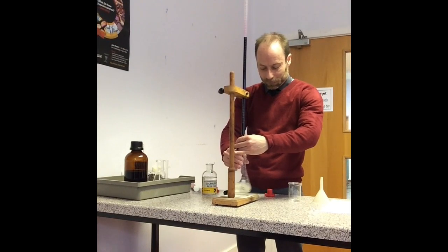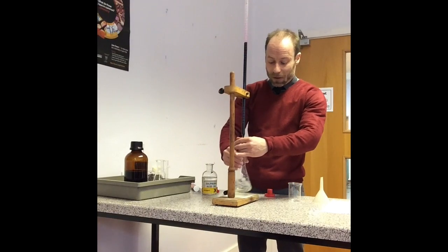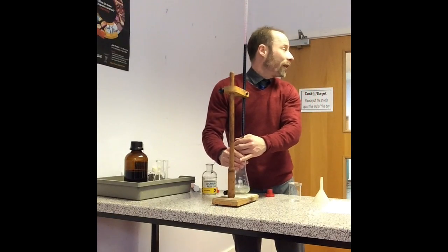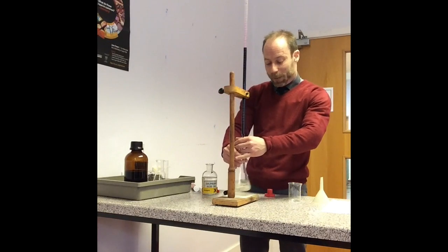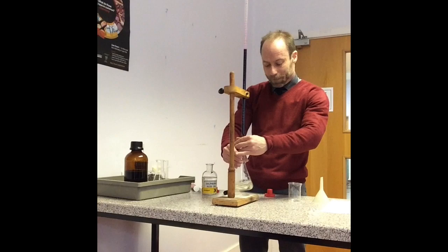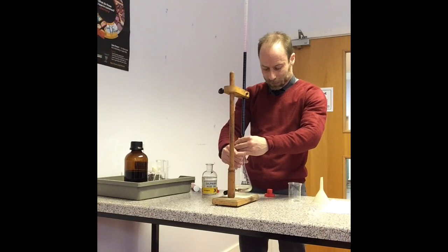I wanted, like, green colour. Yeah. It is originally green because of the iron 2 ions in there. But you basically want the Mn2+ is kind of like a pale pink, but because it's very pale, you don't see it. So I'm now down to about 22 or so. And it is taking slightly longer to disappear.